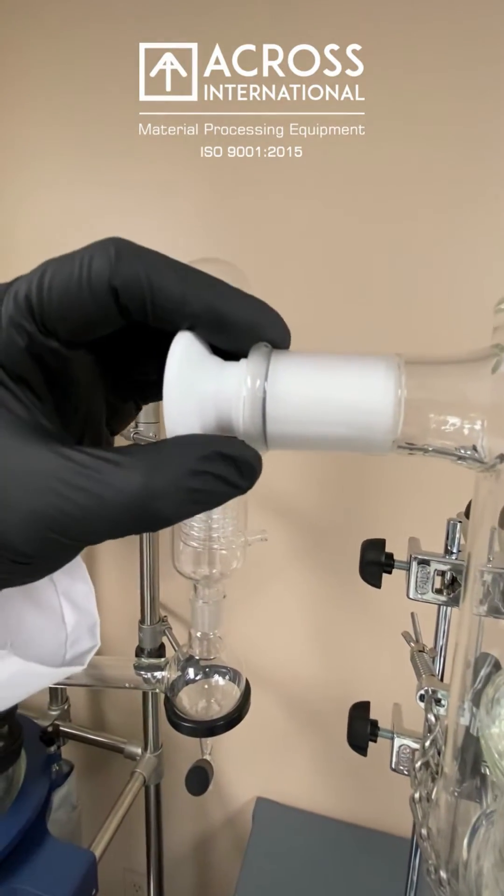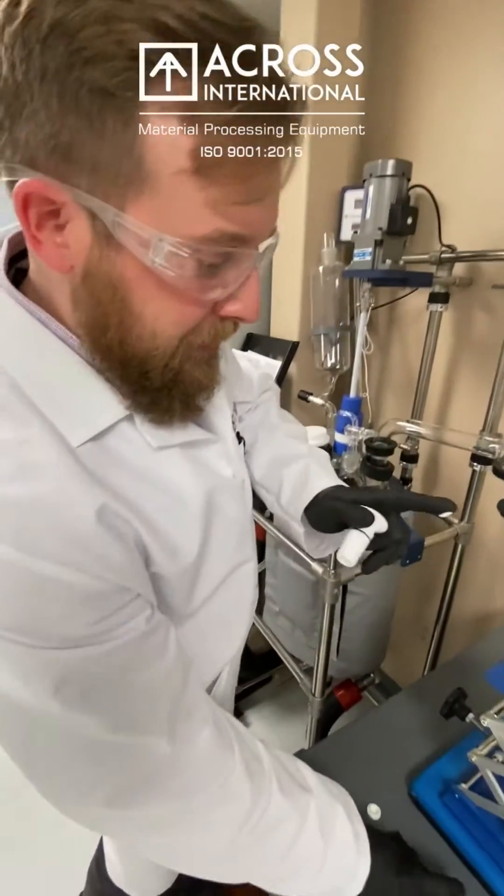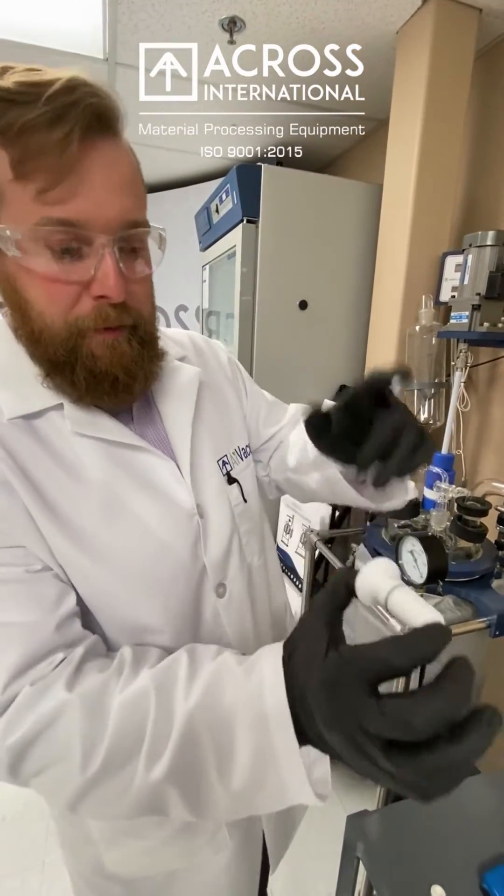If you'd like, we can go ahead and wet this with some vacuum grease and take a look at how it would work. Some people will put it on their finger — I normally just put the tube on there and drop a little bit — but today we'll do it proper.